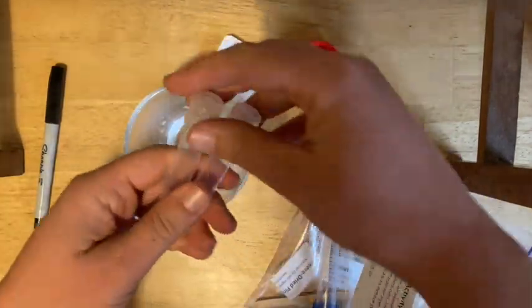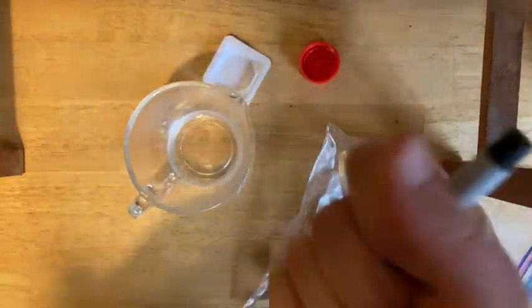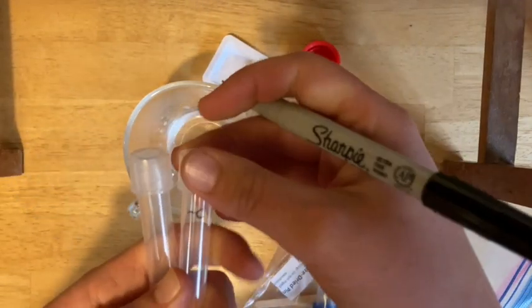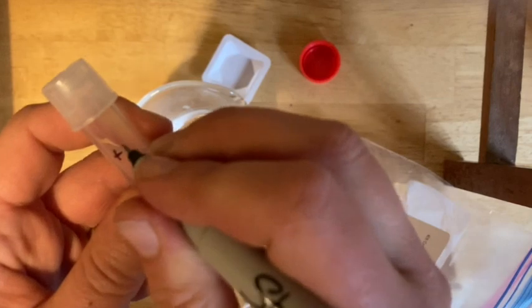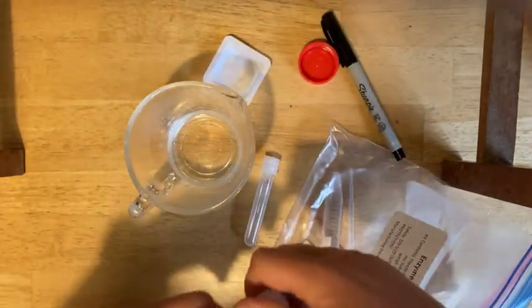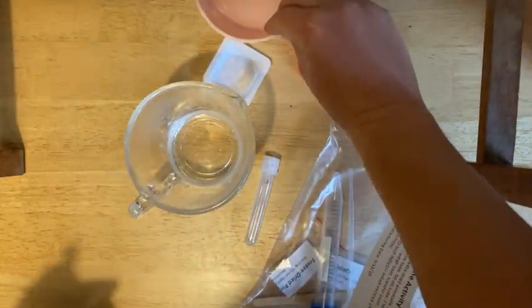Take your two test tubes and label them using your sharpie — label right on the tube itself, not on the cap. Label one minus C; the C is for control. This one is going to be gelatin and just water. Label the next one plus B — that's your positive test for bromelain, the one you're going to add the pineapple juice to. Get something to set these upright in, like a cup or measuring cup.